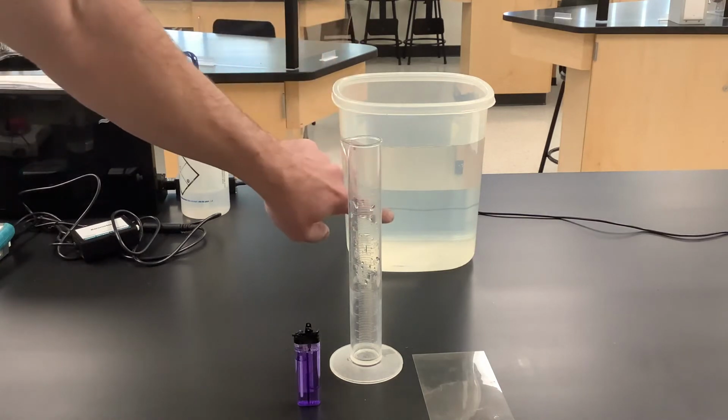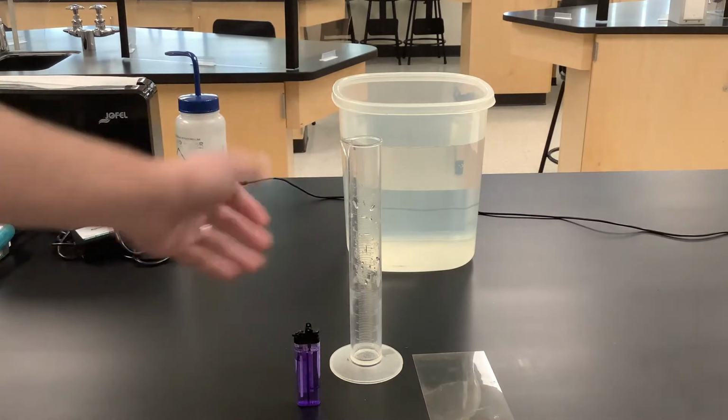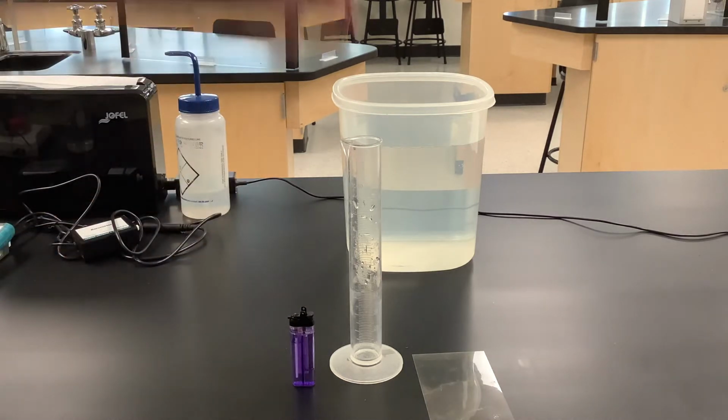So you see in the background here, we have a bucket full of water. We're going to fill this full of water, and then we're going to submerge the lighter and release it so that it bubbles through the liquid and fills up our graduated cylinder.